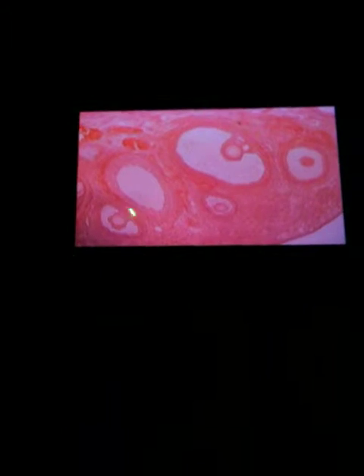That's a secondary. No, that's a primary. What follicle is that? Well, let me ask you a question. Does this area here look similar to that area there? Yeah. Very similar. The only thing that's different is the size of the follicle. Right. So this actually is an initial tertiary follicle that's being expanded. How about this over here? Secondary. Okay, what does a primary look like? How about this? All right, primary, secondary, tertiary.